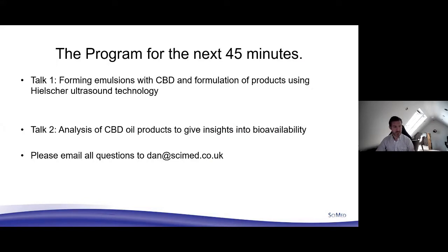of CBD products and other botanical extracts. We're going to follow that up with a second short talk about the characterization of them, looking specifically at particle size and product stability. We're going to split this into two talks. It's going to be about 45 minutes in total. The first one, as we said, is about formulation using ultrasound. We're going to be looking at CBD mostly for this one, but it's broadly applicable to any botanical extract. The second one is going to be about the analysis of these products to give some insights into particle size, bioavailability, and sort of shelf life and stability.